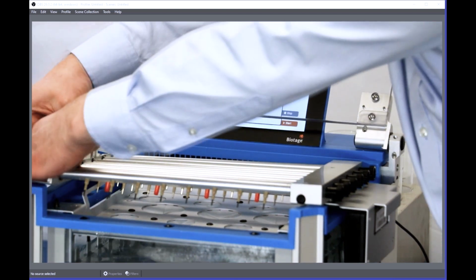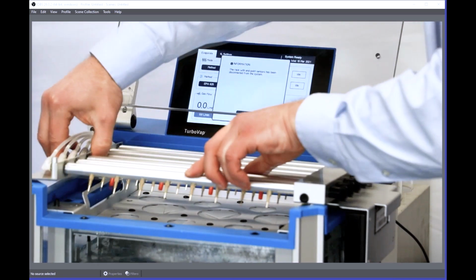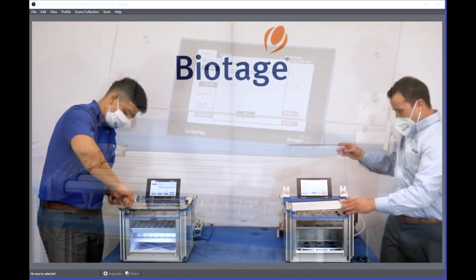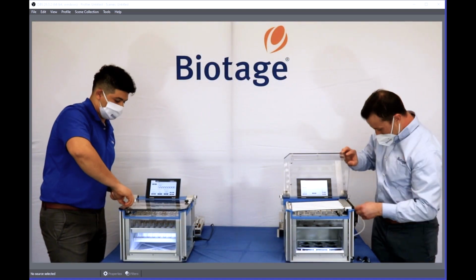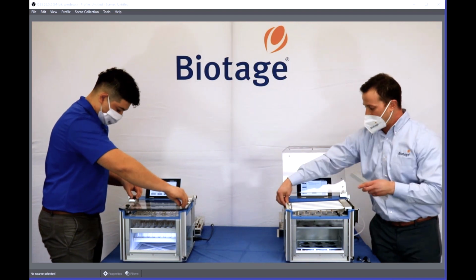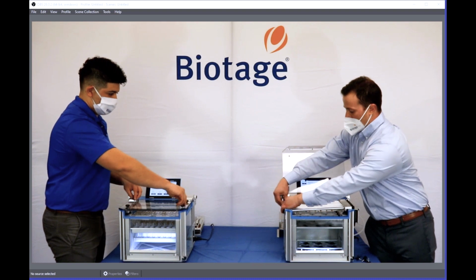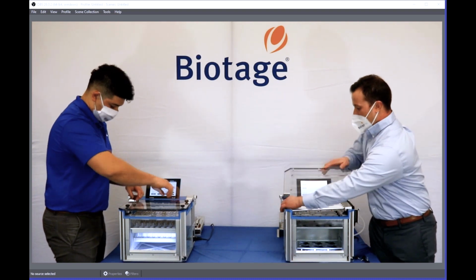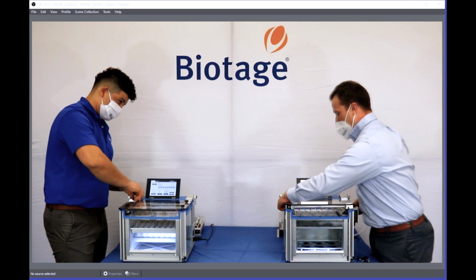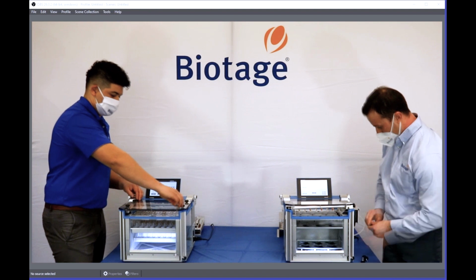Full service demo. Mario's quicker than I am. I will get there though as well. I need my plate. Once you connect all your lines, there's a plate to actually cover the lines up. And then you close your lid and you place your 4 pins back in. I will actually have to take out my manifold as well.